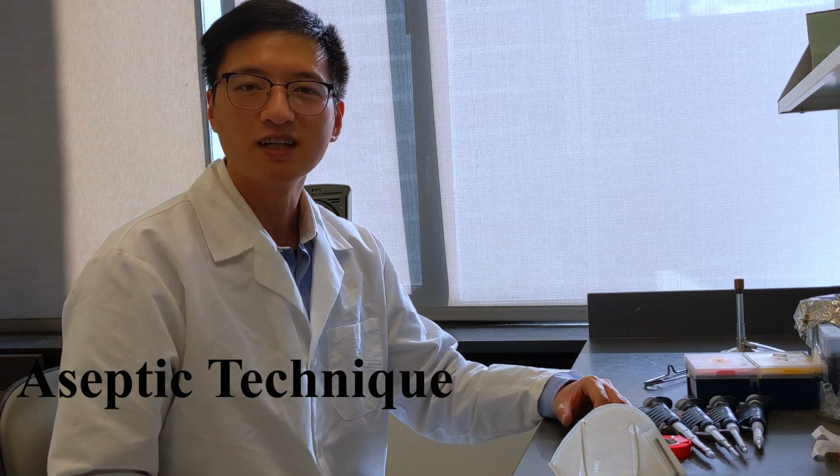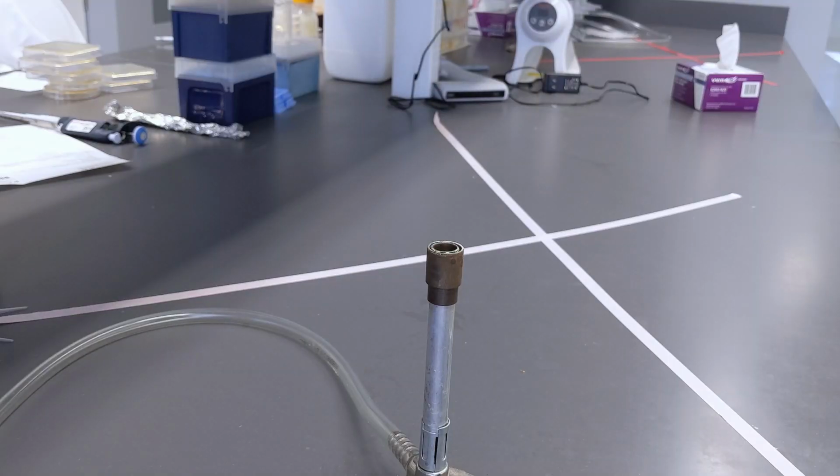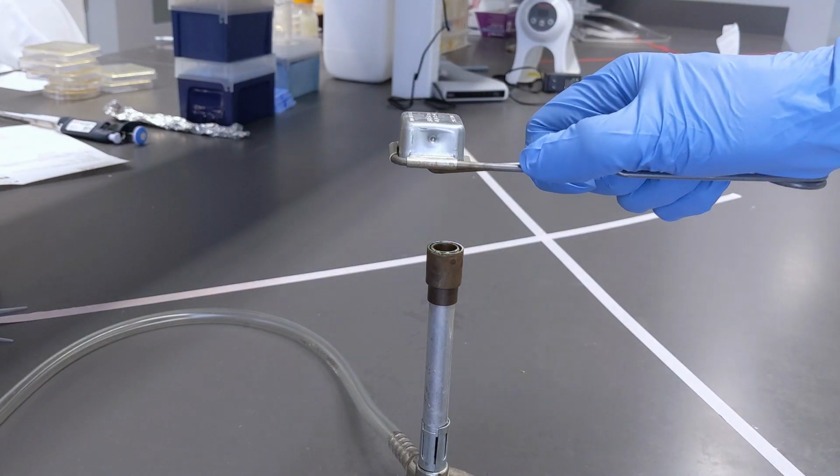Before we start, I'd like to explain the aseptic technique we use, because we want to grow out only the strains that we are interested in. We have to protect them from other microorganisms in our environment, which also want to share the delicious food. Here are several aseptic techniques we use.